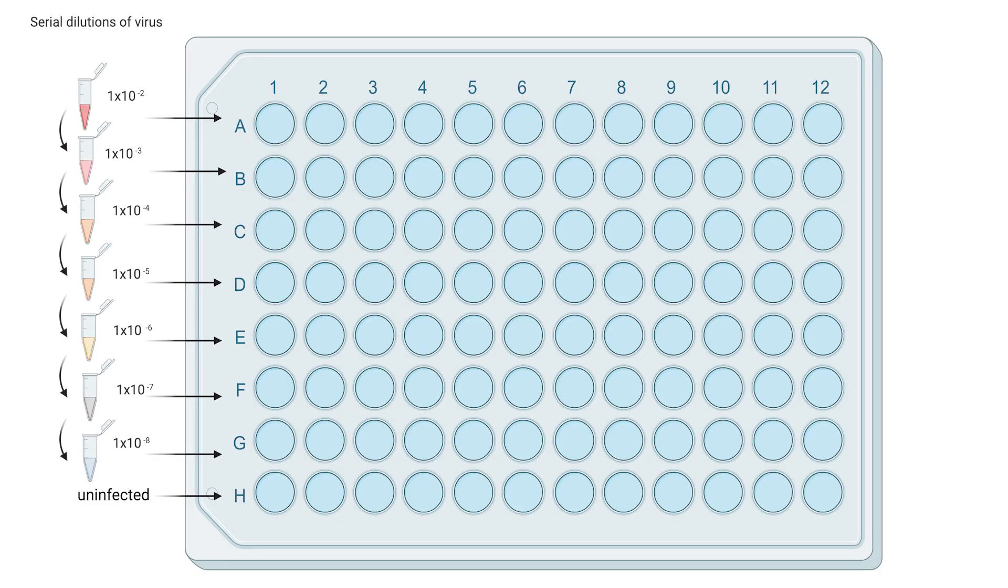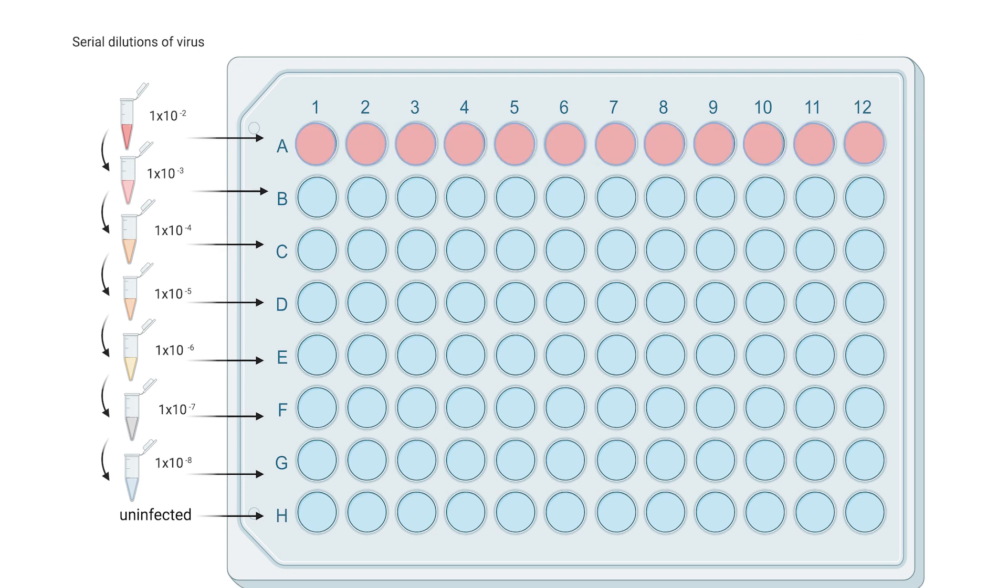In this 96-well plate, each well contains a monolayer of cells. We introduce separate dilutions of virus into each row. For instance, all the wells in row A contain the 10 to the minus 2 dilutions, and all the wells in row B contain the 10 to the minus 3 dilutions, and so forth.